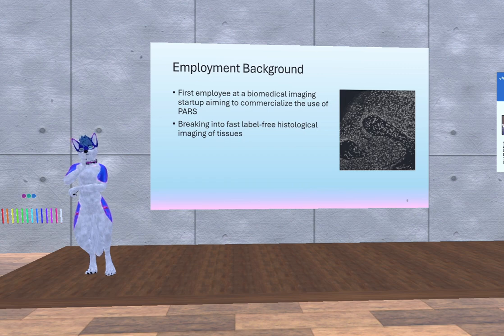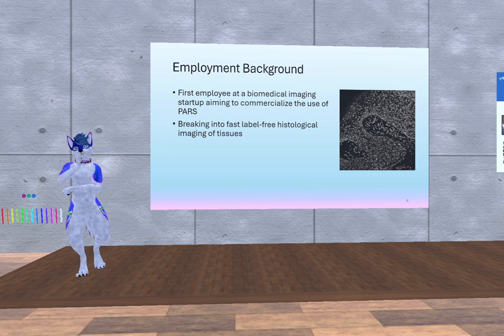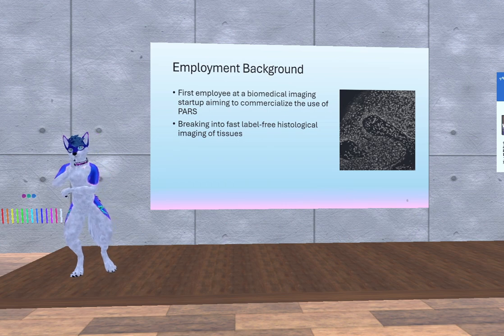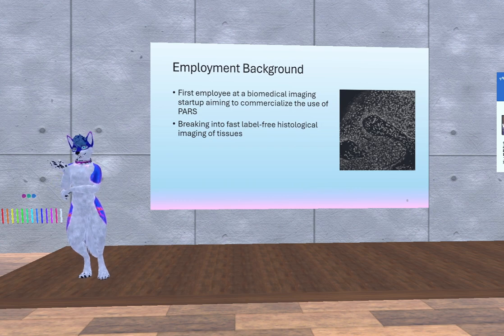Howdy. So I actually did read through a bit of your thesis, and photoacoustic resonance is like a 100-year-old phenomenon. Like you were mentioning a moment ago, there were some other technologies that also make use of that foundational phenomenon. Maybe in simplistic words, it allows for more in vivo imaging at a higher resolution than before, or at least that's the hope of this research. Yeah, exactly. Specifically this modality would likely be well suited for trying to image smaller structures in living tissue, right?